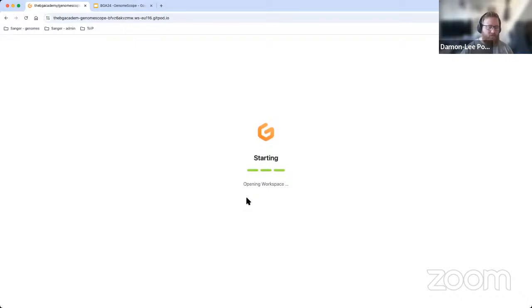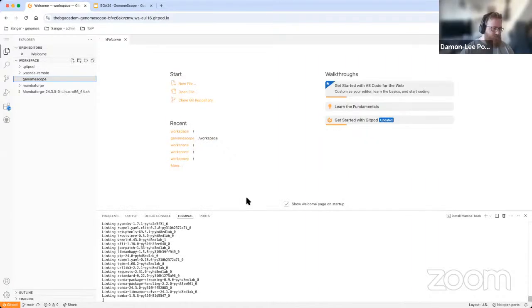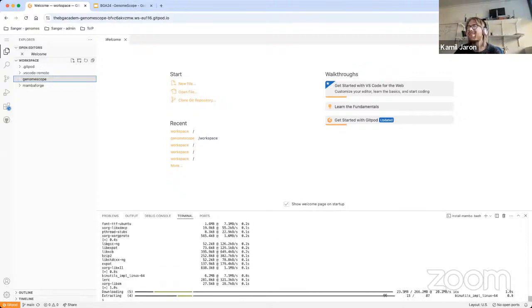Whilst we wait for that, there is a question in the Discord, if that's all right. Yeah, sure. Are there any specific recommendations depending on the type of reads, short or long? And are there any Kmer values to use in particular? Yeah, actually there are.